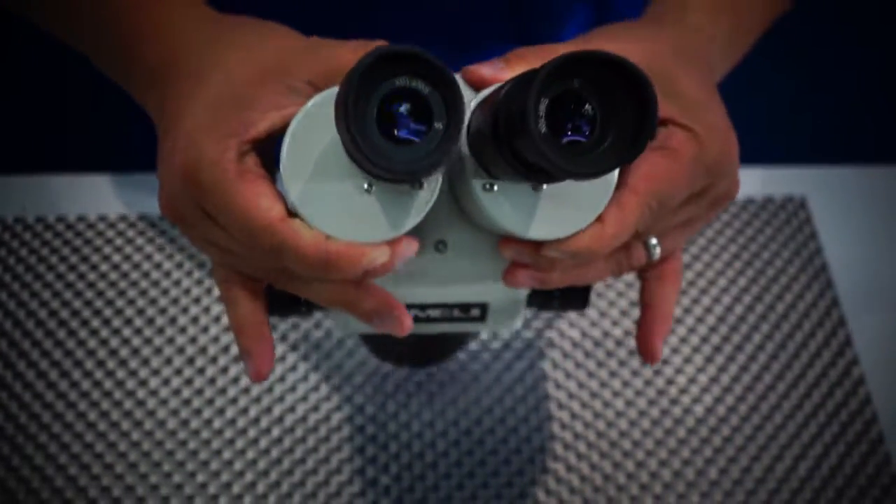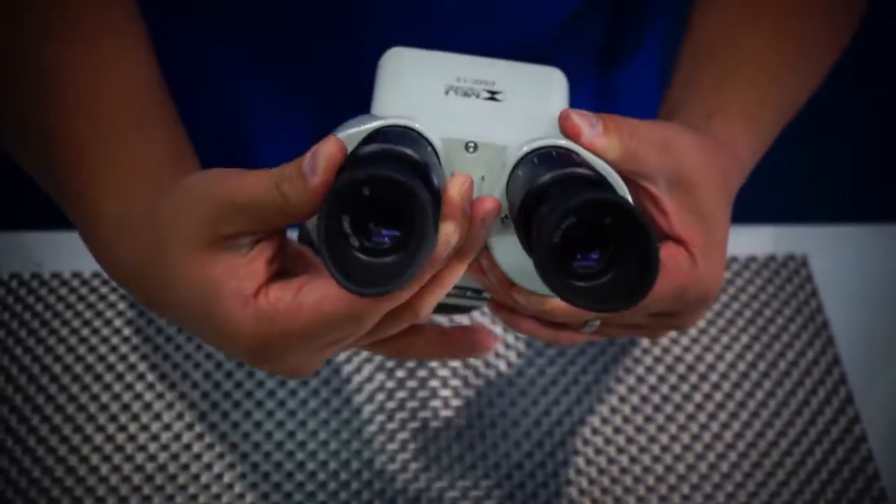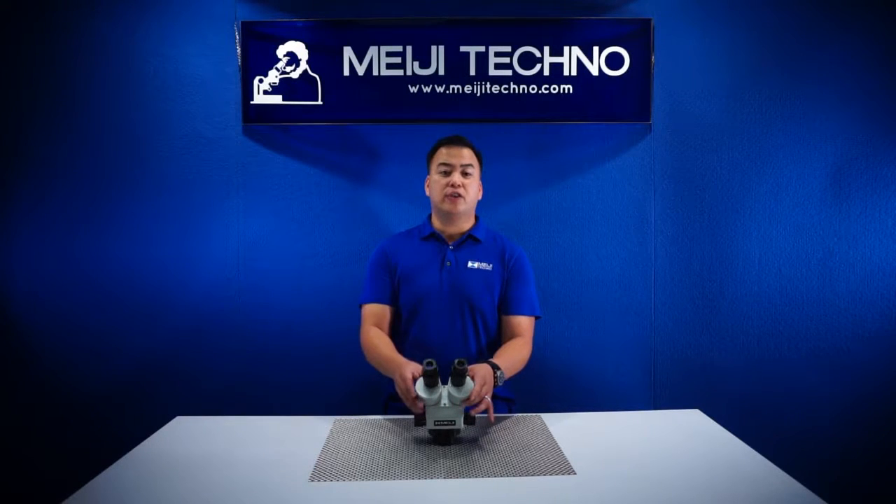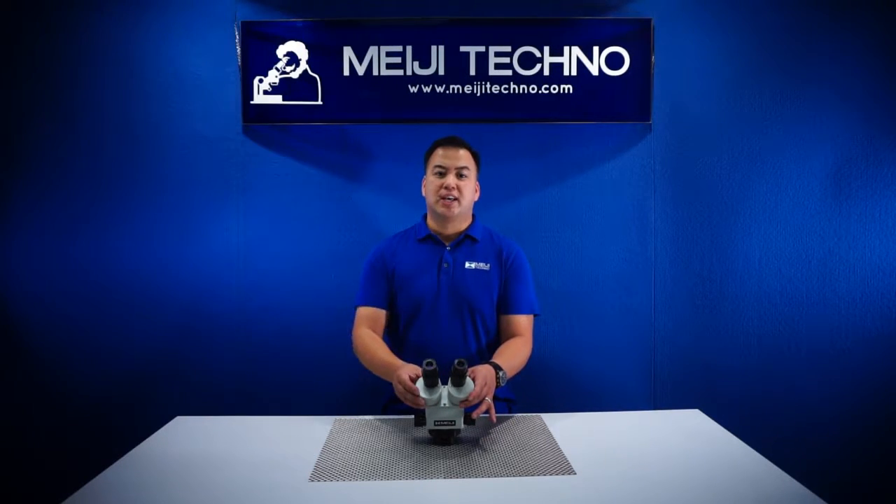The interpupillary distance of the EMZ-13 can also be adjusted from 54 millimeters to 75, accommodating different eye tube diameters, and it has a base working distance of 90 millimeters.